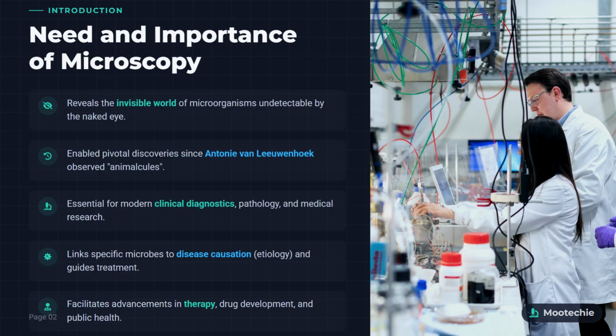Today, it is essential for modern clinical diagnostics, pathology, and medical research, forming the backbone of disease investigation. Critically, it links specific microbes to disease causation, known as etiology, and directly guides treatment decisions. Ultimately, it facilitates advancements in therapy, drug development, and public health policies that protect communities worldwide.